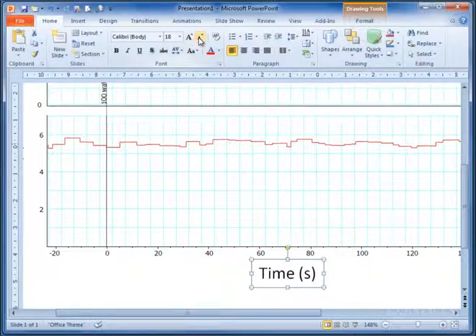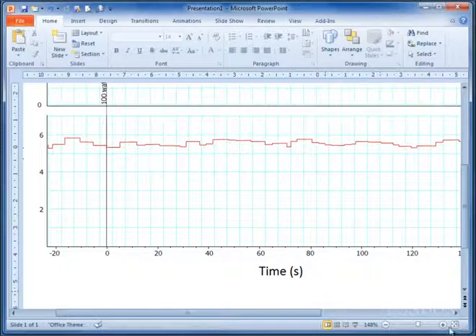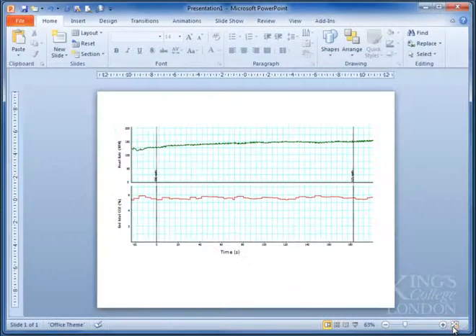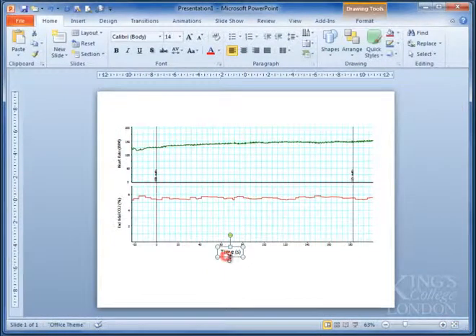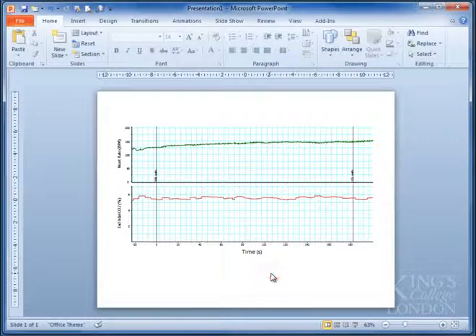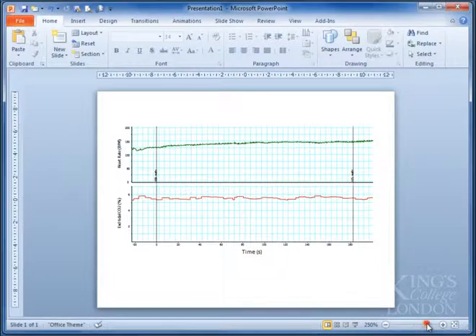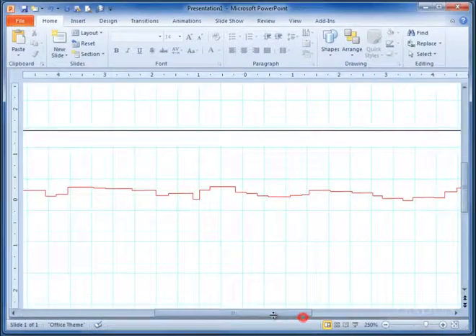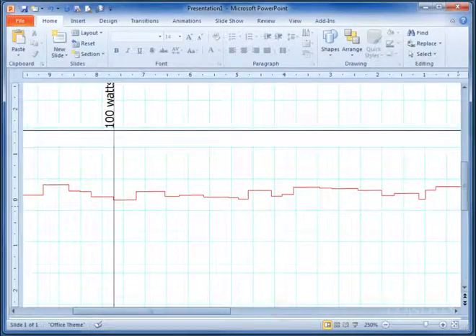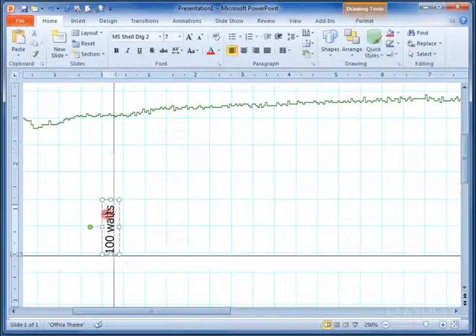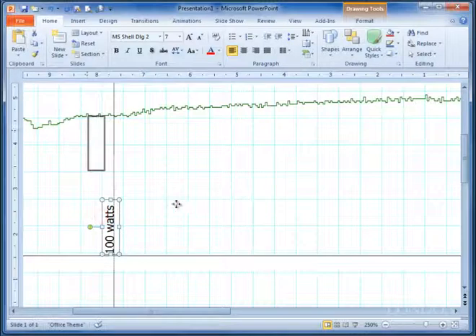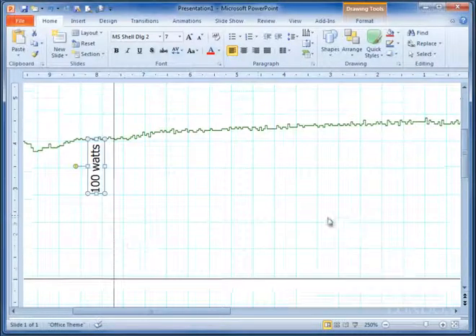Put that there, make them a little bit smaller so it suits the scale, and have another look. Okay, we can move that into the center. Okay, so we've now still got this 100 watts, sorry, and 125 watts. So we can go in here and we can remove 100 watts and we can take it up the top, for instance.